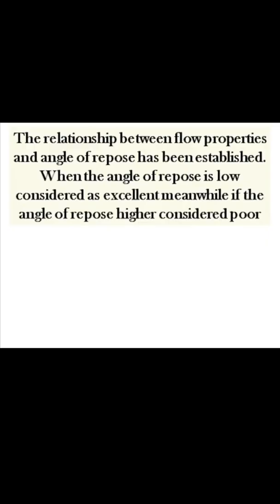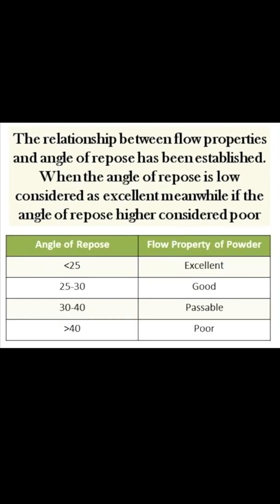The relationship between flow properties and angle of repose has been established. When the angle of repose is less than 25 degrees, the flow is said to be excellent. Meanwhile, if the angle of repose is more than 40, the flow is considered to be poor.